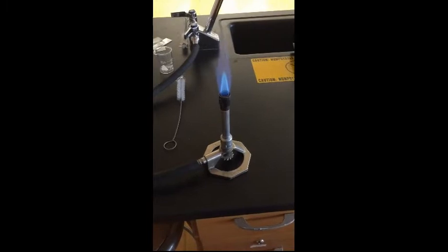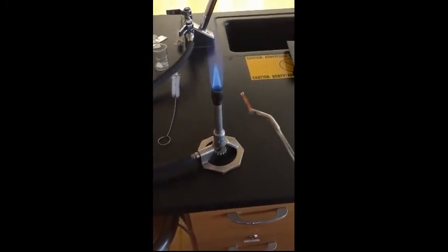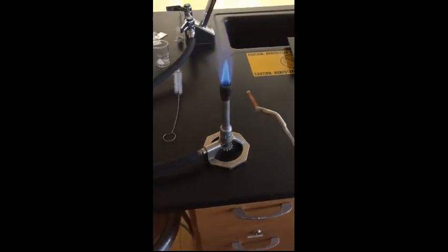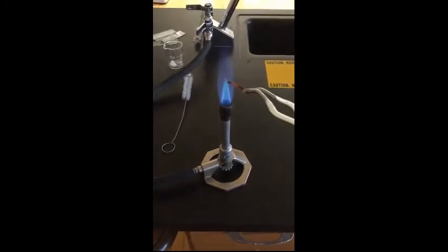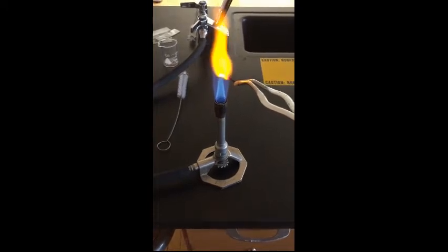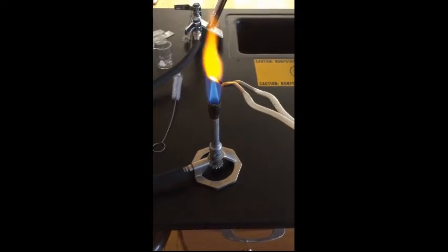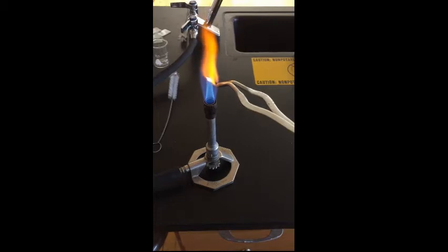Here is the first procedure. I'm taking a piece of copper strip. In the lab it says copper wire. We're using copper strip. And I'm going to put it in the flame. Remember, the hottest part of the flame is right there. Make your observations. You can actually see some green in there.